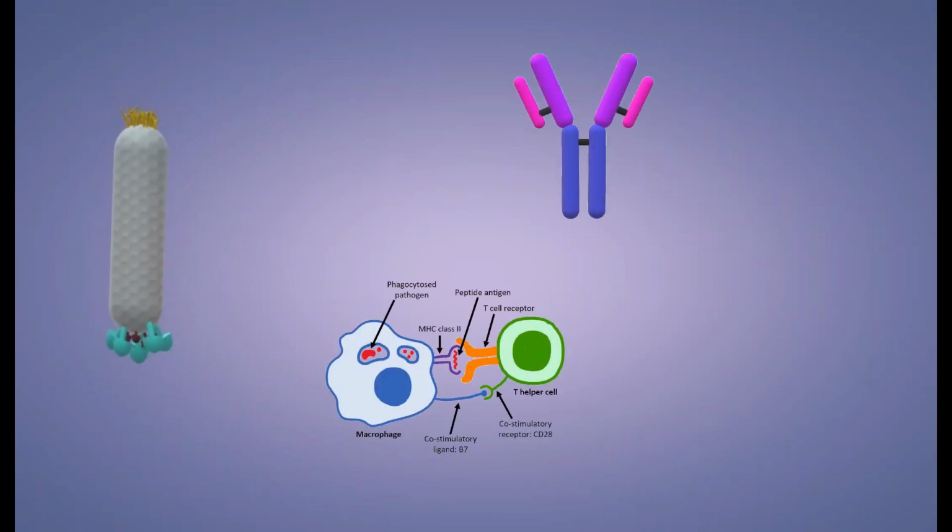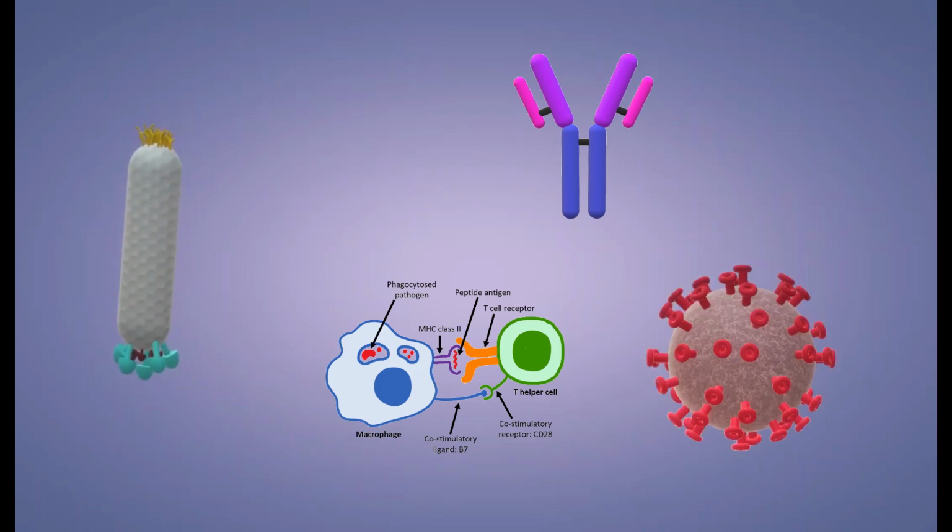But the real importance of this breakthrough is actually the applications that it has, like the development of antibodies, cancer treatment, or even COVID-related applications. This will be described further on. But what are really the bases? Well, this is all possible thanks to the fact that we can introduce foreign DNA into the phage capsid genes in order to synthesize a fusion protein.